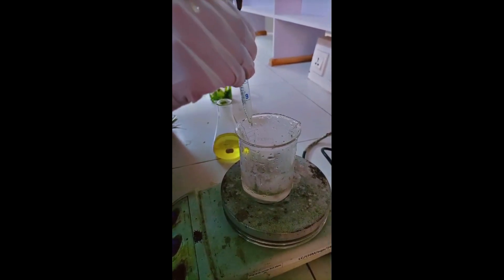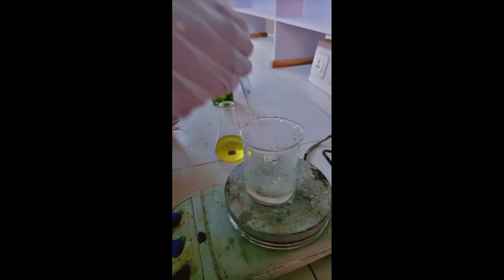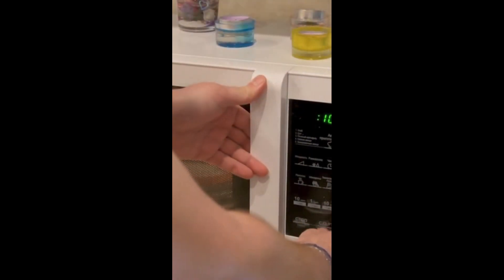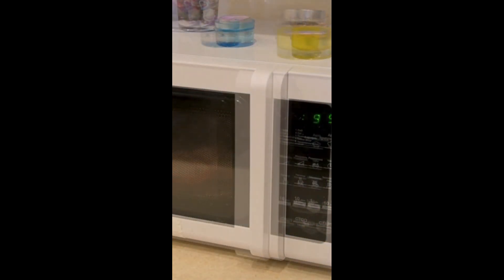This precipitate is the zinc oxide nanoparticles. Once the reaction is complete, filter the solution using filter paper and a funnel. Collect the solid zinc oxide nanoparticles on the filter paper. Transfer the filtered precipitate to a drying oven and dry at 60 to 80 degrees Celsius until completely dry. After drying, you will obtain a fine powder of zinc oxide nanoparticles.